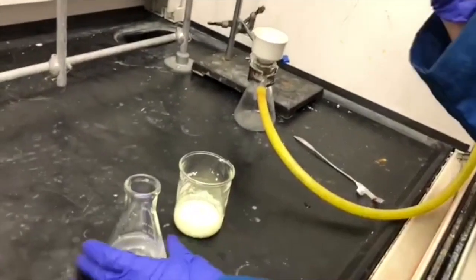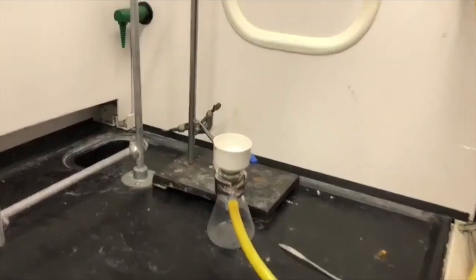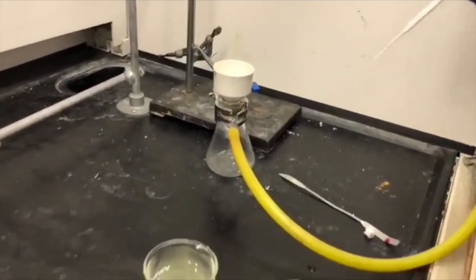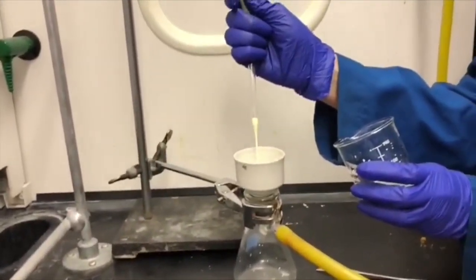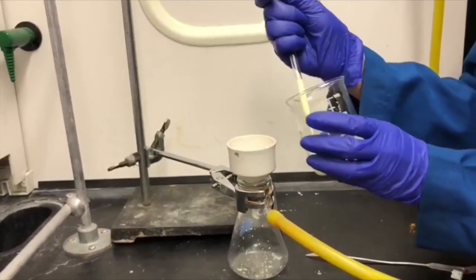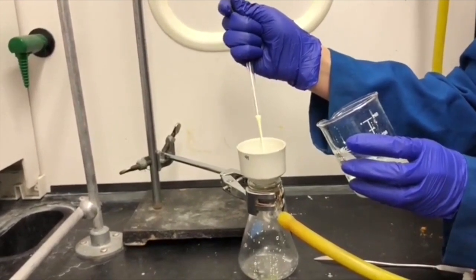We then filter it by using suction filtration. This is to get rid of the water or other solvents by sucking them out through the filter paper. And I'm wetting the filter paper here with water. We're going to dump our contents in there onto the filter paper. And then we're going to wash it with cold water to wash away the impurities.